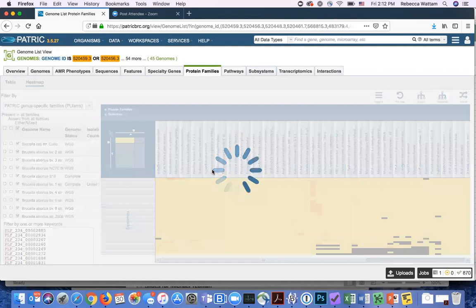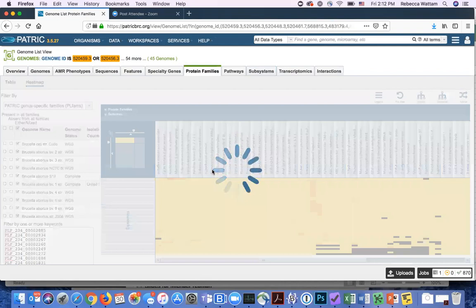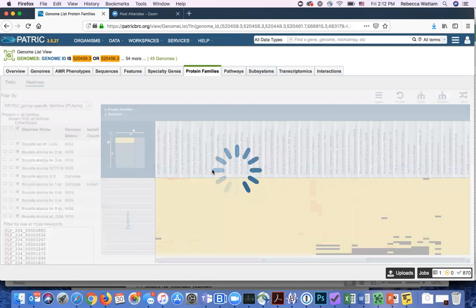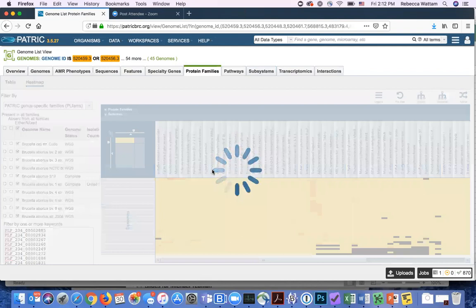Now remember it's important when you're building a multiple sequence alignment that you choose the same thing or the alignment will be pretty meaningless. One of the good things about the protein family sorter is it's not only a visualization, it also allows you to extract the data underneath it.